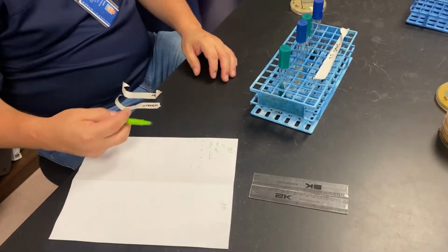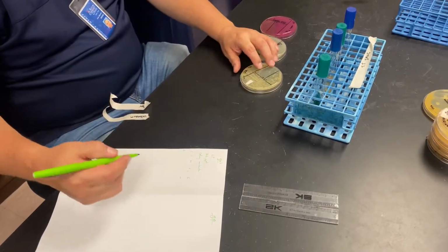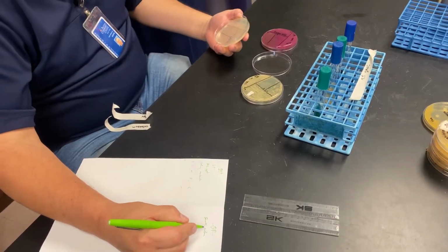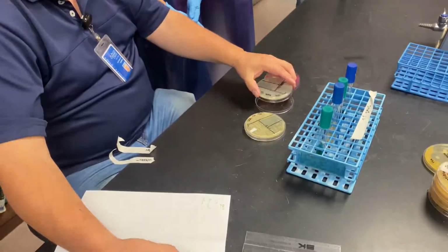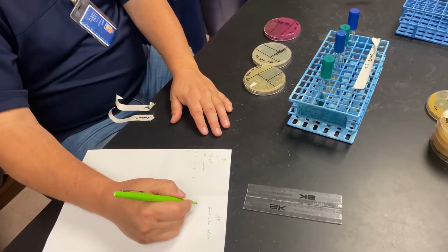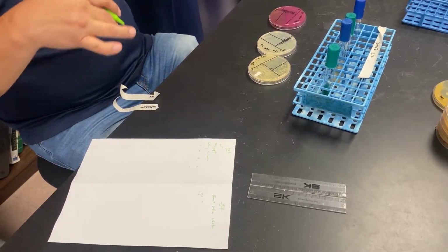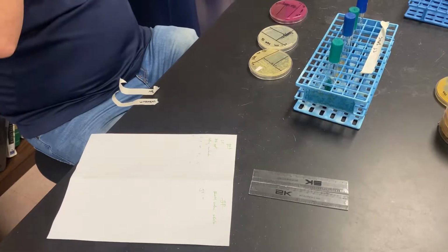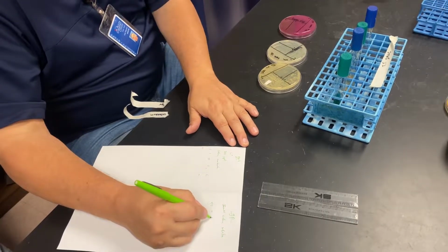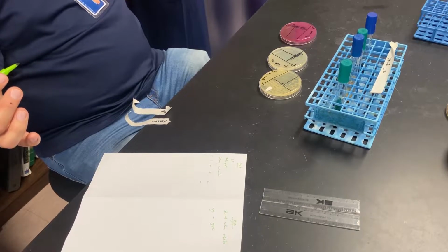For my gram-pos, all I know is that it is a small colony, and the color is, say, white. I don't know anything else. So what do I need to do next? Gram stain. So I need to do a gram stain. And then based on that, I'm just going to say, I'm just making this up, my gram stain came out to be a gram-positive coccus. What's the next thing I need to do?